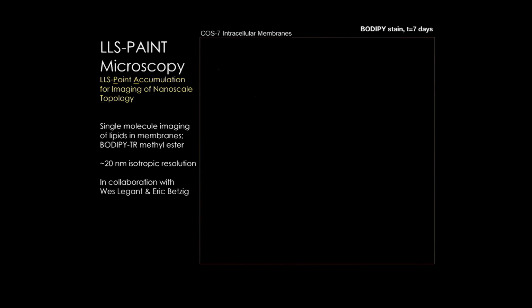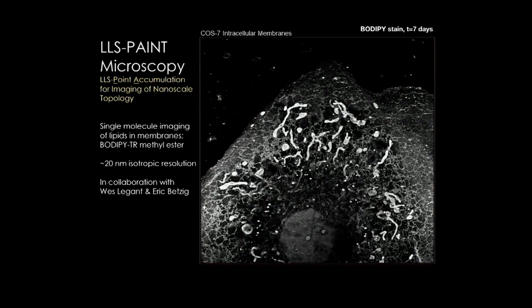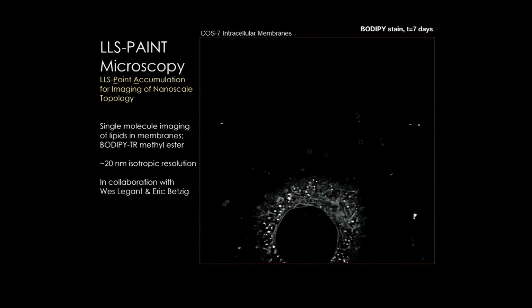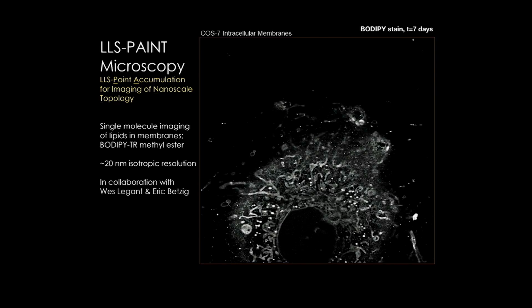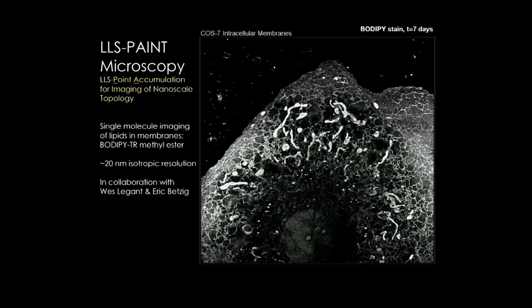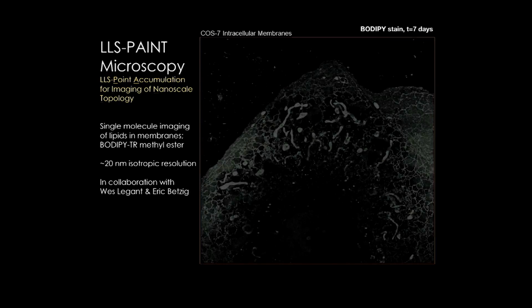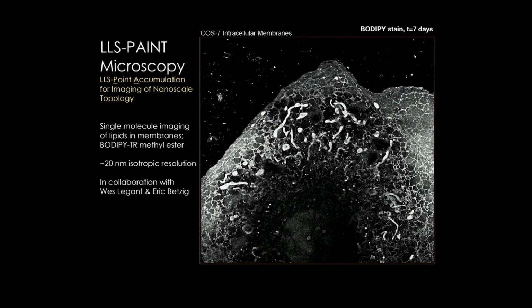And when we do that, we can reconstruct the entire organelle distribution, map it out in 3D through lattice light sheet imaging with a combination of plotting out all the individual distributions of these lipids, using super resolution imaging docked in and put in place.